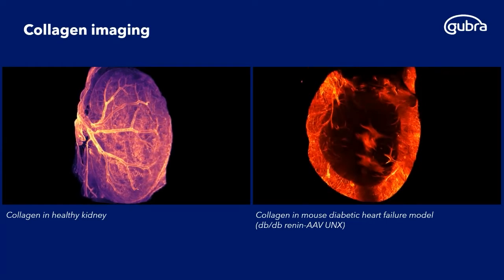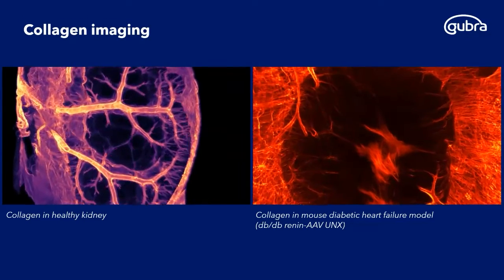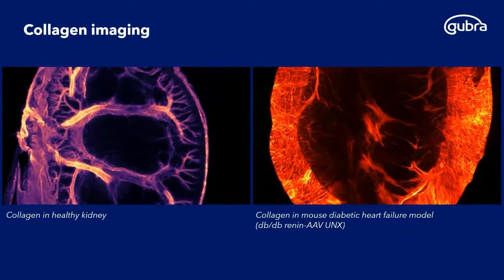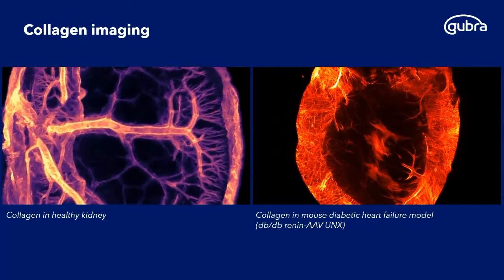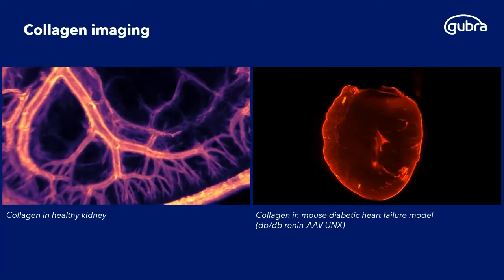And this imaging can help. Now you can see in the middle of the heart these large fibrotic patches, to characterize the volume of fibrosis and then make conclusions based on the effect of fibrosis on heart function in general.